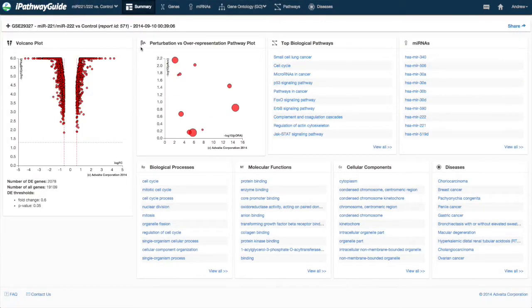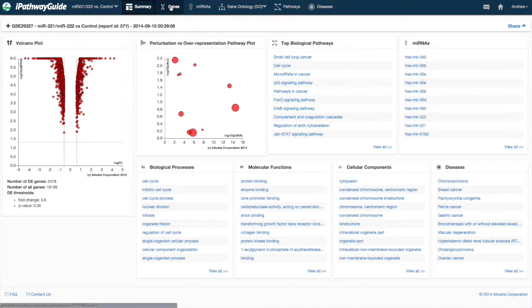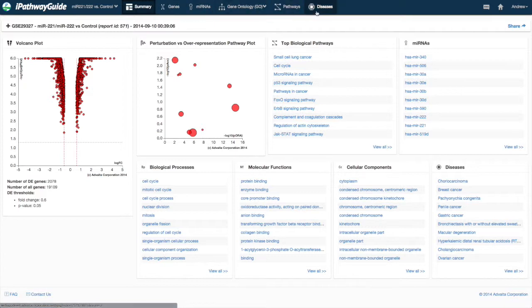The summary page is designed to provide a quick look at the results contained in each of the five main analysis tabs: genes, predicted microRNAs, gene ontology, pathways, and diseases.